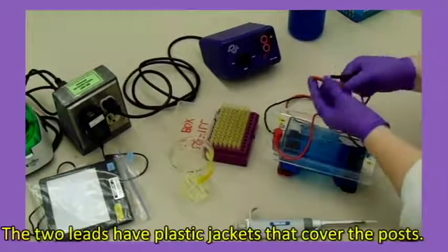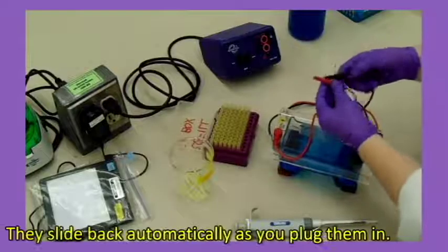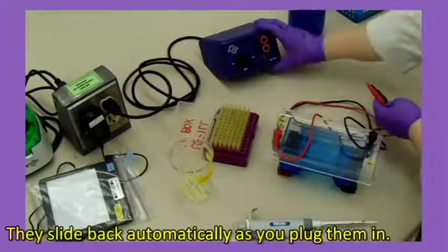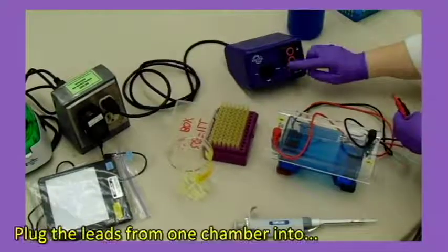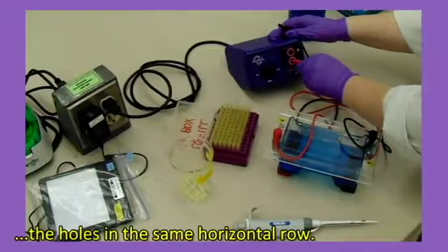The two leads have plastic jackets that cover the posts. They slide back automatically as you plug them in. Plug the leads from one chamber into the holes in the same horizontal row.